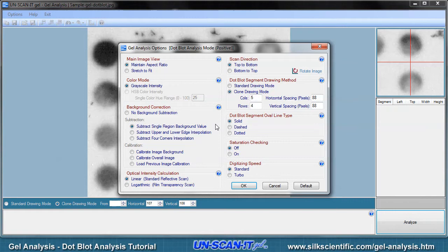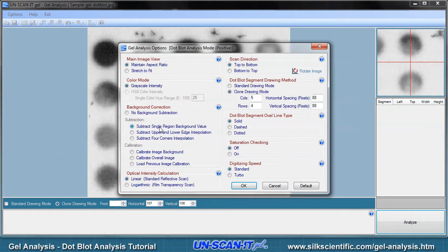Multiple gel analysis options will be presented and you can choose the options that best fit your analysis needs. To make drawing the segment boxes easier, we will use Clone Drawing mode and select 5 columns wide by 4 rows high for this sample dot blot. We will also do a simple background subtraction. For this tutorial, we will simply accept the remaining default options.